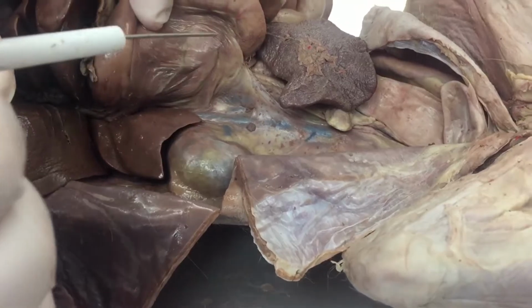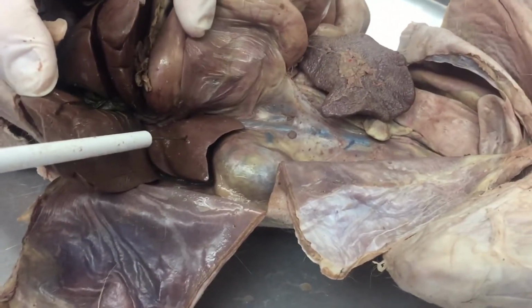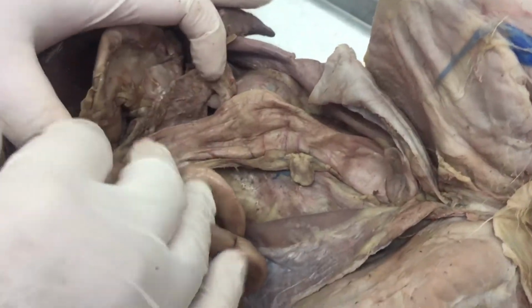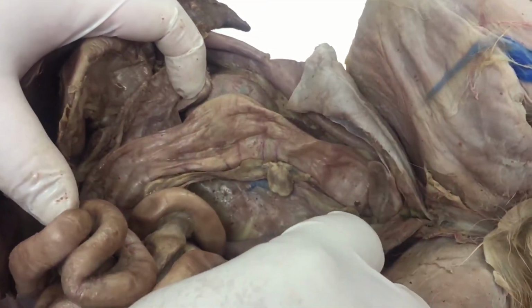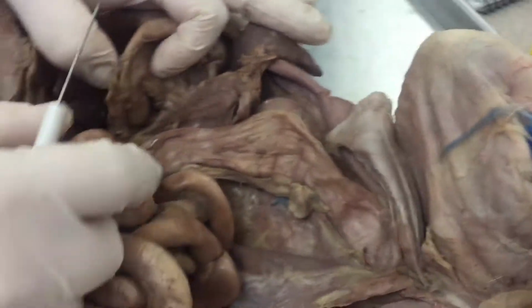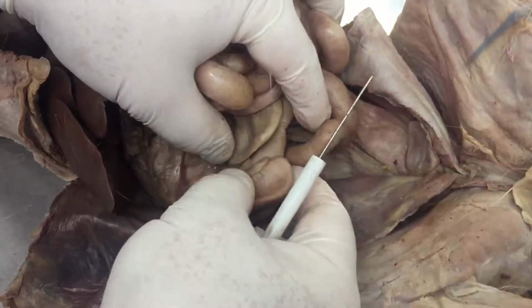And in order to identify the pancreas, a real good idea is, if you take a look and it's got this horseshoe shape sitting directly on top of the kidney, that would be the pancreas. To find the large intestine, all the small intestines and the spleen is pulled away, and then you can see this flattened muscle right here, which is the large intestine. Large intestine is made up, this is the very end, so the sigmoid colon, the descending colon, the one going across is called the transverse colon. The one which is going up right after the small intestine is called the ascending colon.